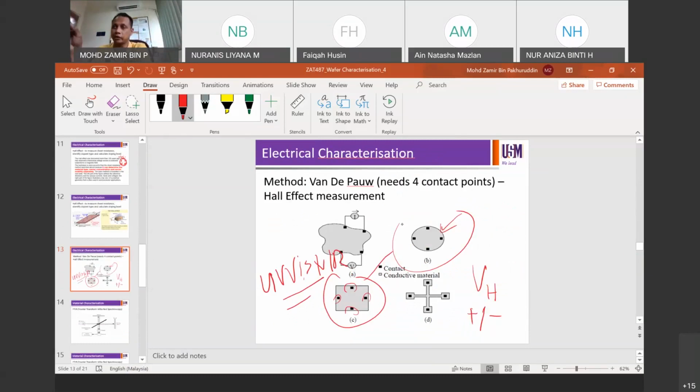There are also electrical characterizations, which can be done by IV measurement, Hall effect, 4-point probe is the simplest. If you work in Fuji Electric, if you get to work on hard disk fabrication, HDD, hard disk drive industry, you need to do a lot of characterizations on magnetic properties. When I was in Fuji Electric, I did a lot of HDD magnetic characterization, like VSM. You can have a look at this. Magnetic, many more. So magnetic, optical, surface morphology, electrical. It really depends on which type of industry you are in.